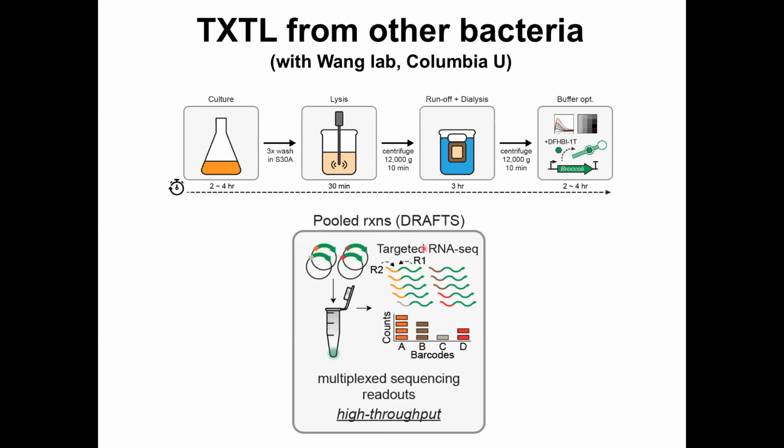Or literally the production, the aptamer was used to define the biochemical setting of the lysate with respect to magnesium, potassium, and so on. And after, you use barcoded DNA with promoters and next generation sequencing, and you literally count by next generation sequencing the frequency of your RNA that is produced from a library of promoters.